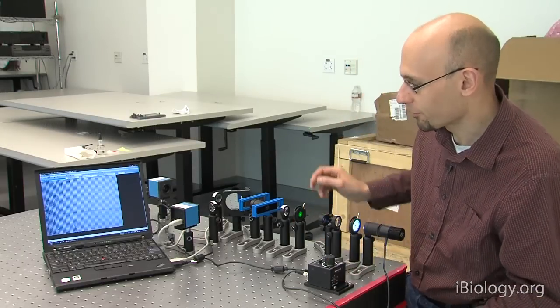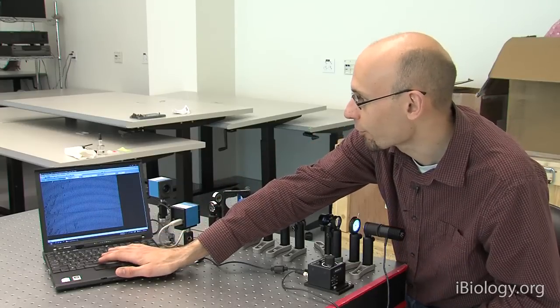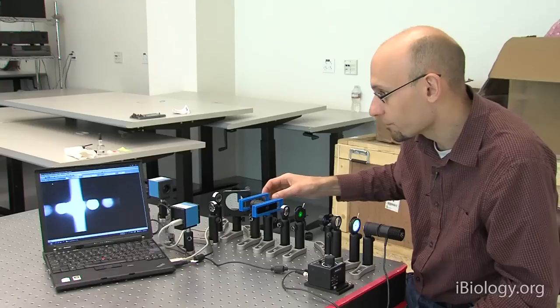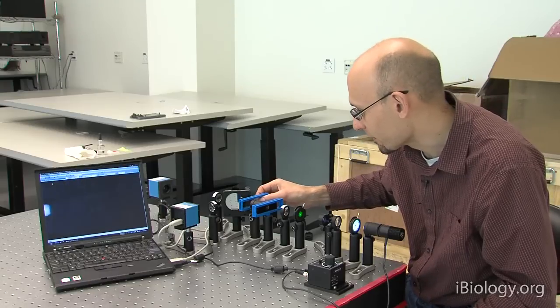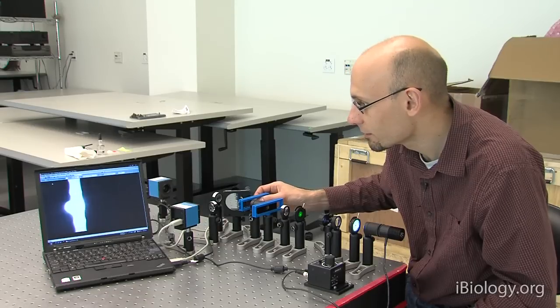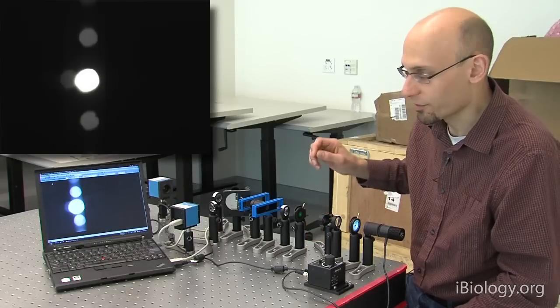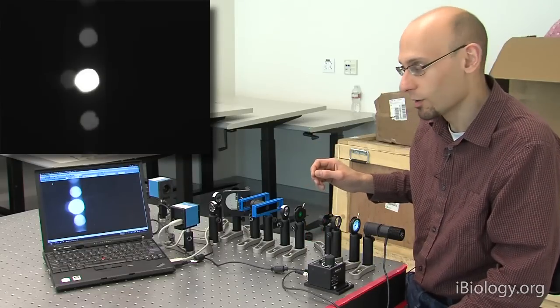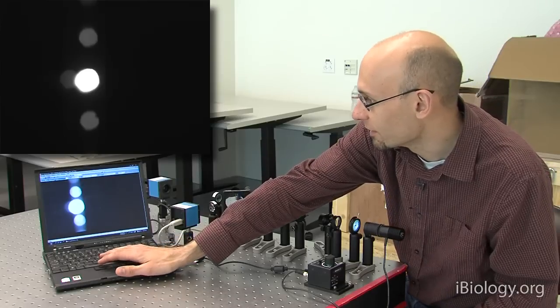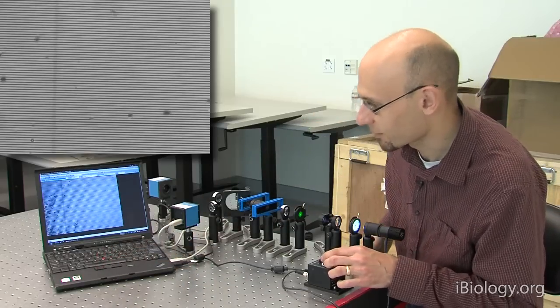There's nothing special about the vertical direction. I've got another pattern here, so let me switch back to the back focal plane so I can get it positioned properly. So if we now go and slide this pattern in, now we can block all the horizontal information. And so based on everything I've told you so far, you should expect to see just the horizontal lines. And in fact, that's exactly what you see.